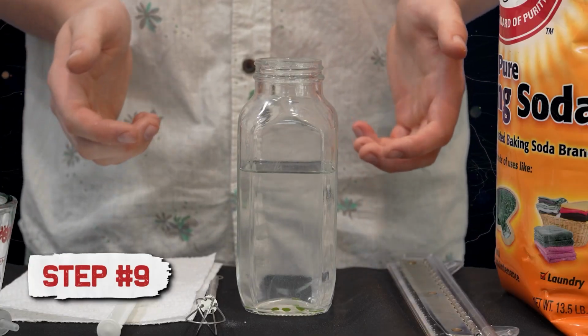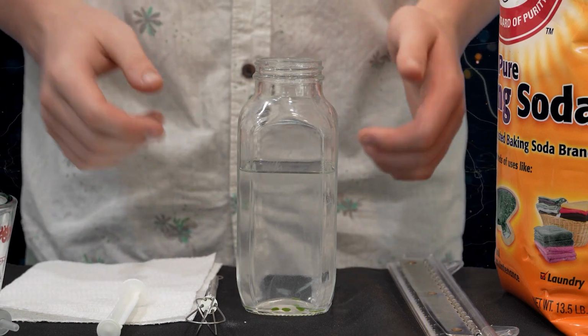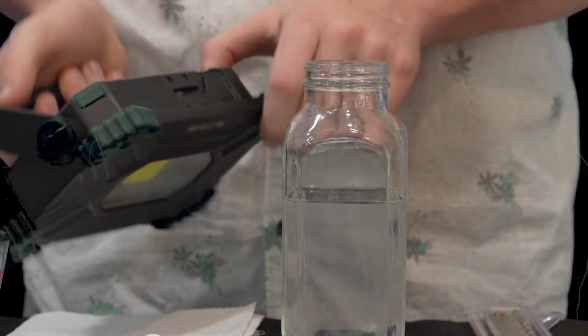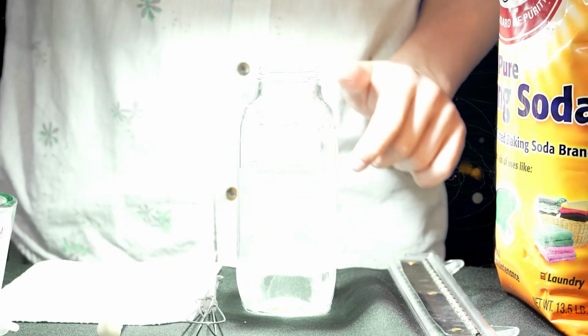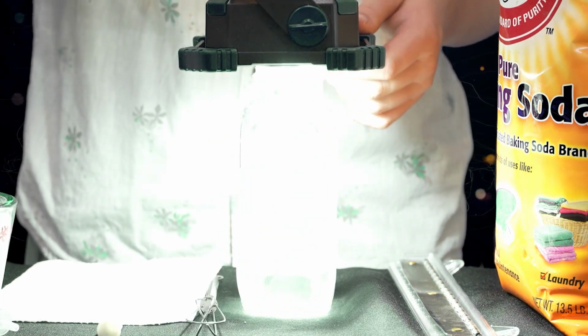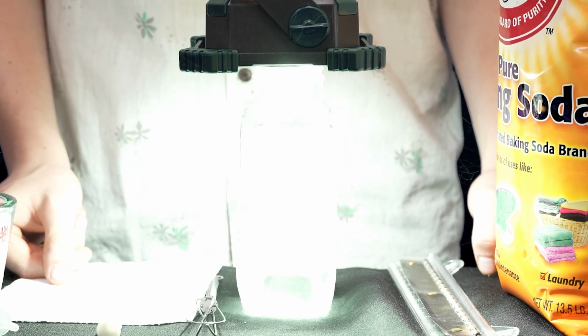I'm not exactly sure what step we're on anymore, but it'll say somewhere on screen what step we're in, but this is the final step. All you're going to do is take your light source, so this will be your flashlight, turn it on, and then put it right on top of your container. And then eventually you should be able to watch the leaves rise.